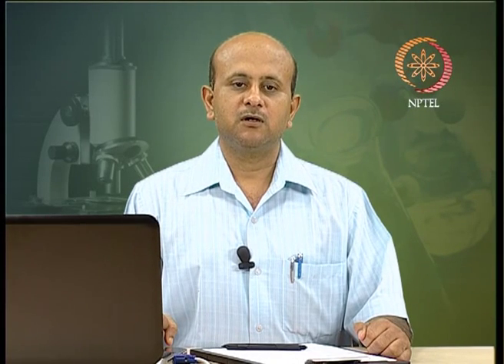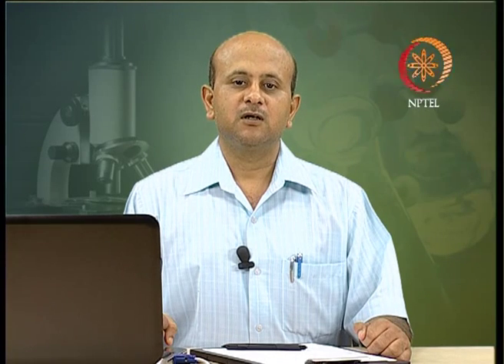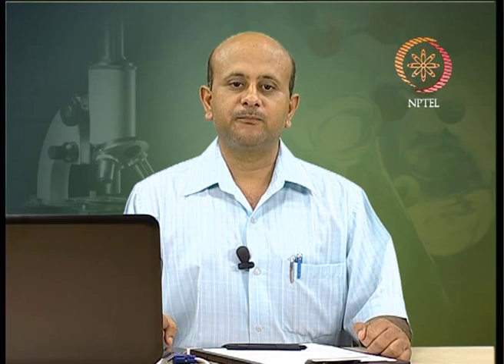Now, as the chamber is evacuated, the maximum speed is not limited by air friction, and the rotors do not have to be aerodynamically designed as compared to other centrifuges.